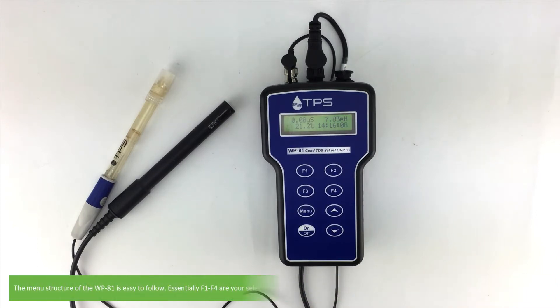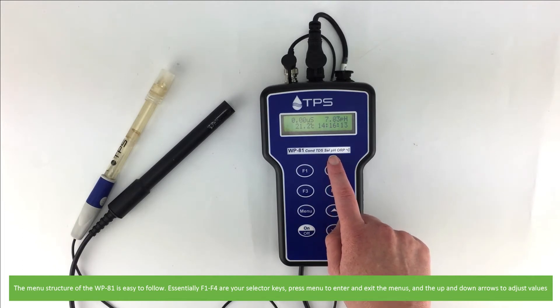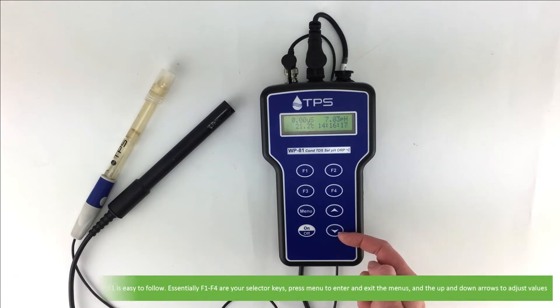The menu structure of the WP-81 is easy to follow. Essentially, F1 to F4 are your selector keys. Press menu to enter and exit the menus and press up and down arrows to adjust values.